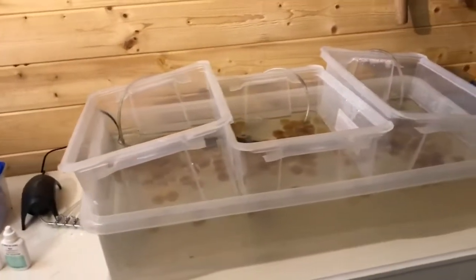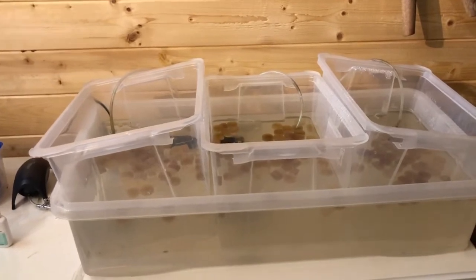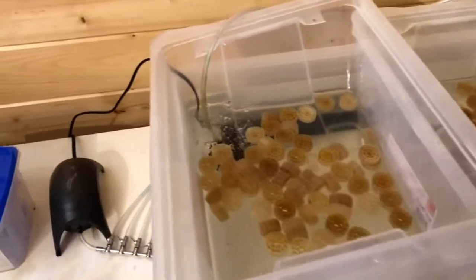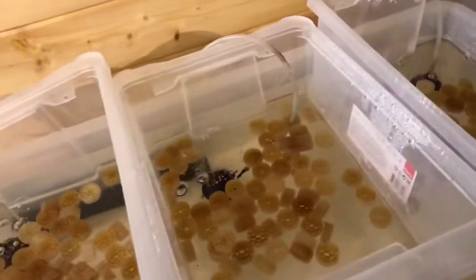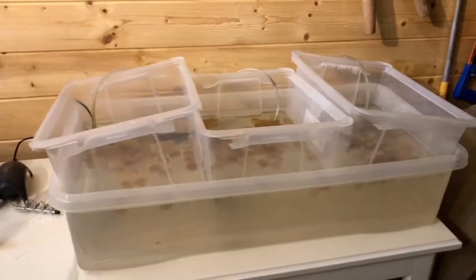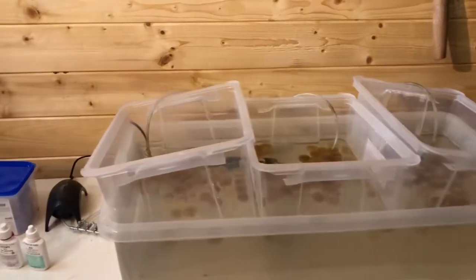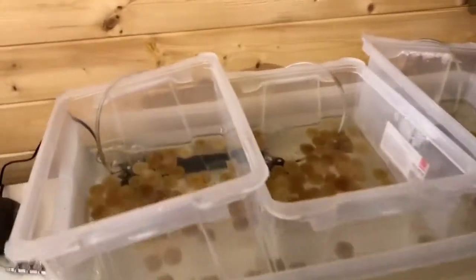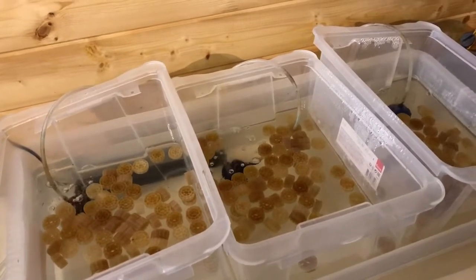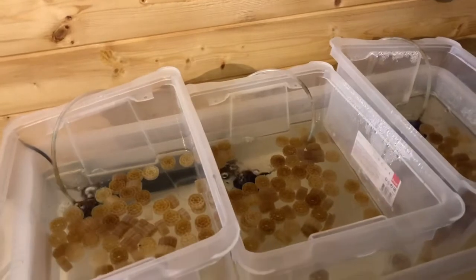What we've got here is 3 tanks with 5 litres of dechlorinated tap water in. They're all heated to 20 degrees. And I've got some mature K3 in there, plenty, and it's got the aeration, the air stone. And I'm going to add 5 milligrams per litre of ammonia and let the bacteria get to work, and then I'm going to test the water and see how much carbonate has been used up, and also look at how much nitrate has been produced.